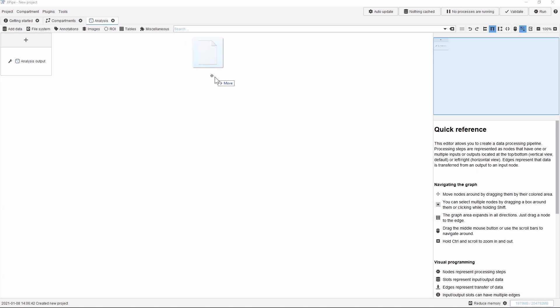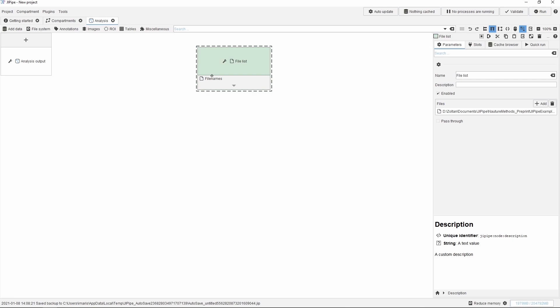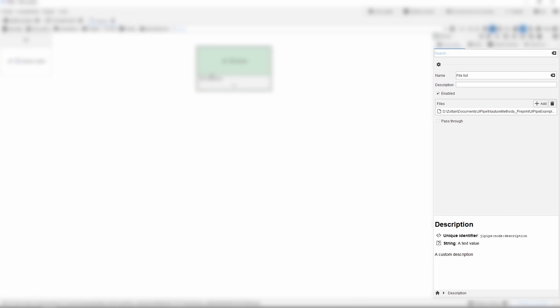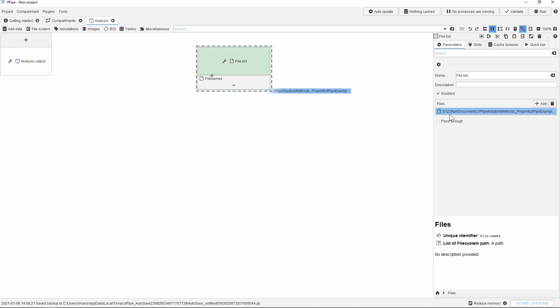Similarly to ImageJ, we can drag and drop the selected image onto the user interface. This image file is now represented by a node. A node can be selected, dragged and repositioned with the mouse. After selecting a node, on the right side we will find the parameters characteristic of this particular node, for example the file path of this image. This file path then appears on the output of the node.